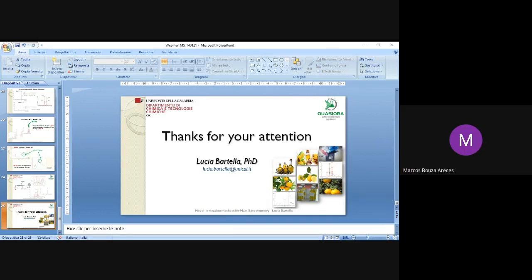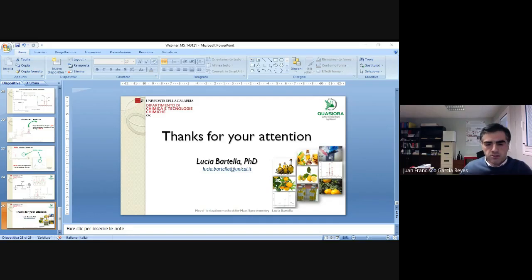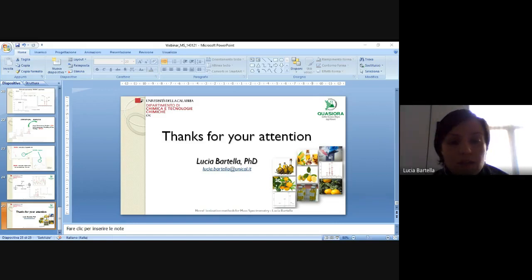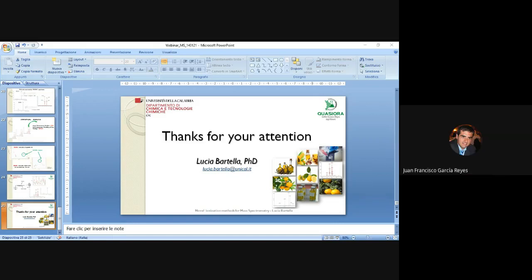Hi, Juan, can I? Yeah, sure. Marcos? So hi, Lucia. Really nice presentation. I just want to ask you, they are really two silly questions, but the tyrosols and the alpha tocopherol, did you measure it in positive or negative ion mode? Sorry. He is asking you the ionization mode, whether it is positive or negative.